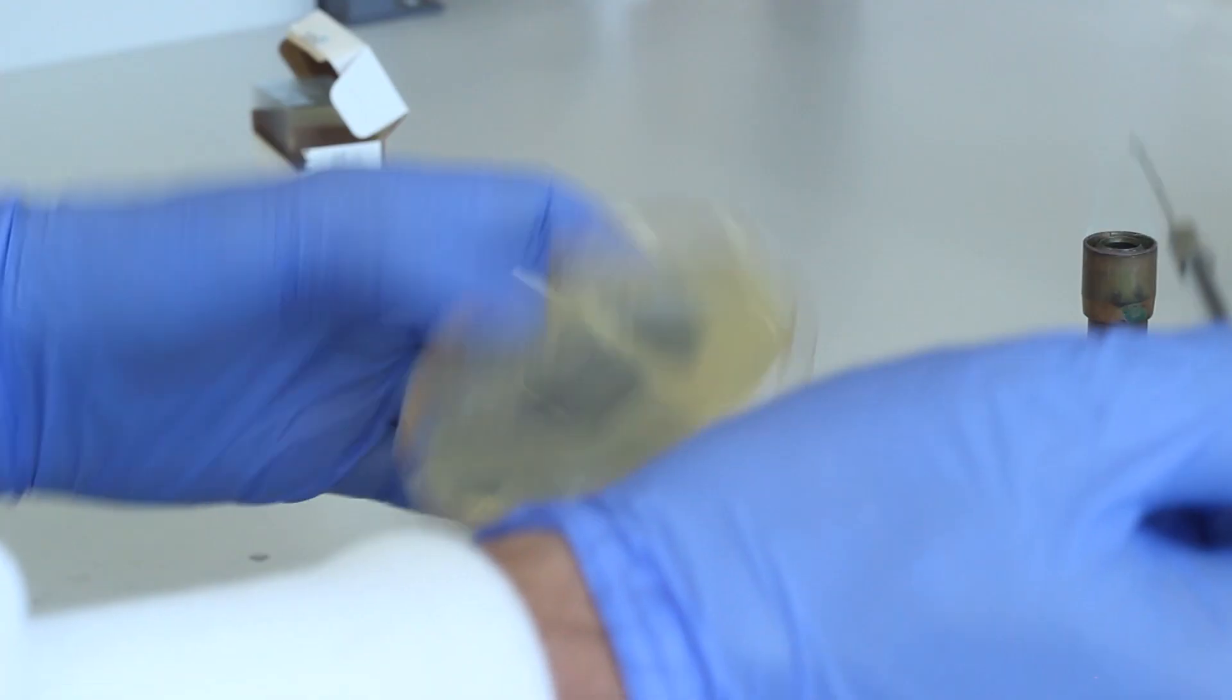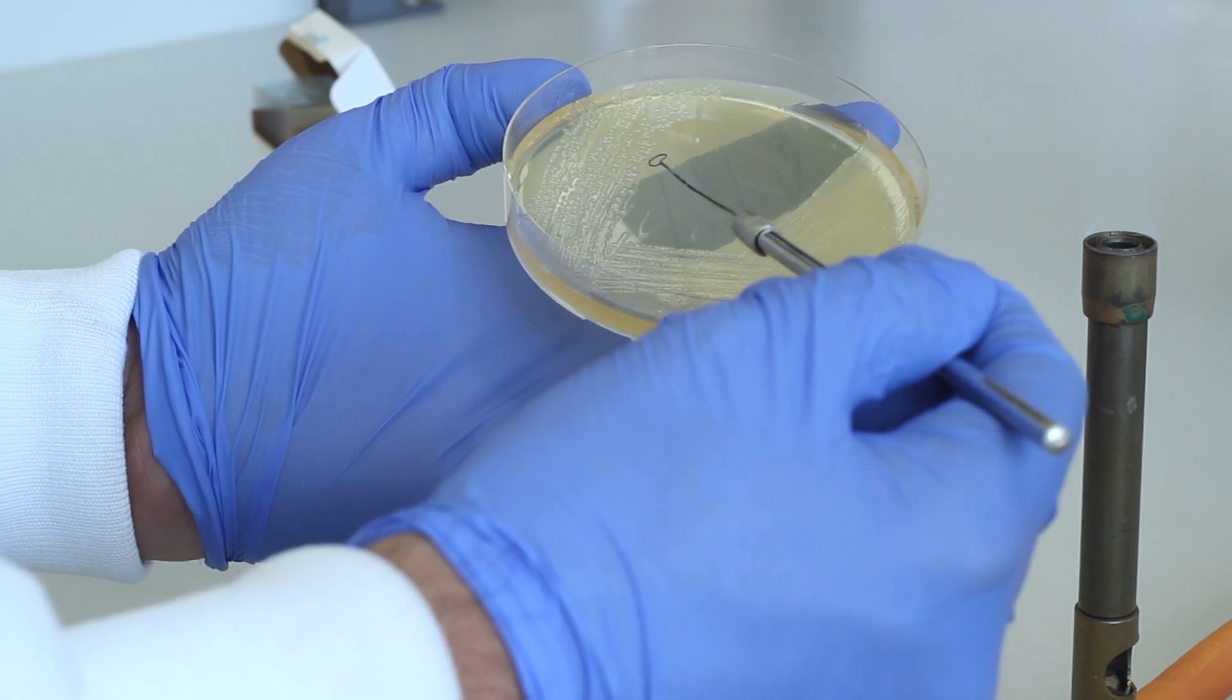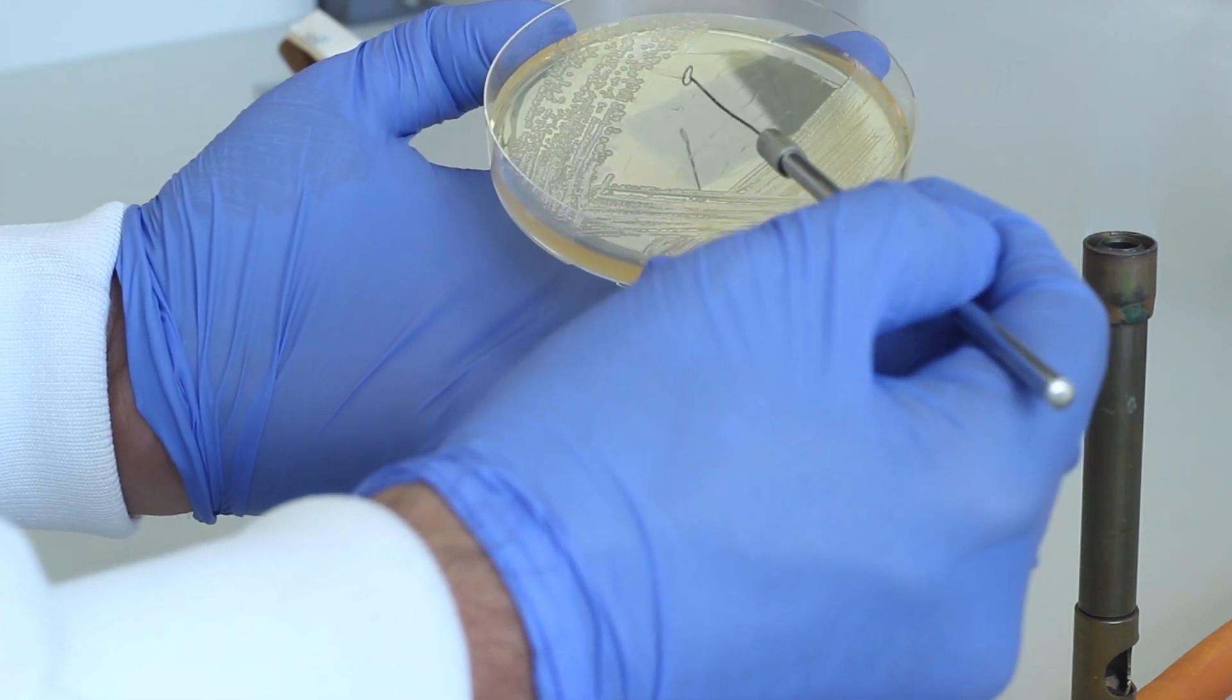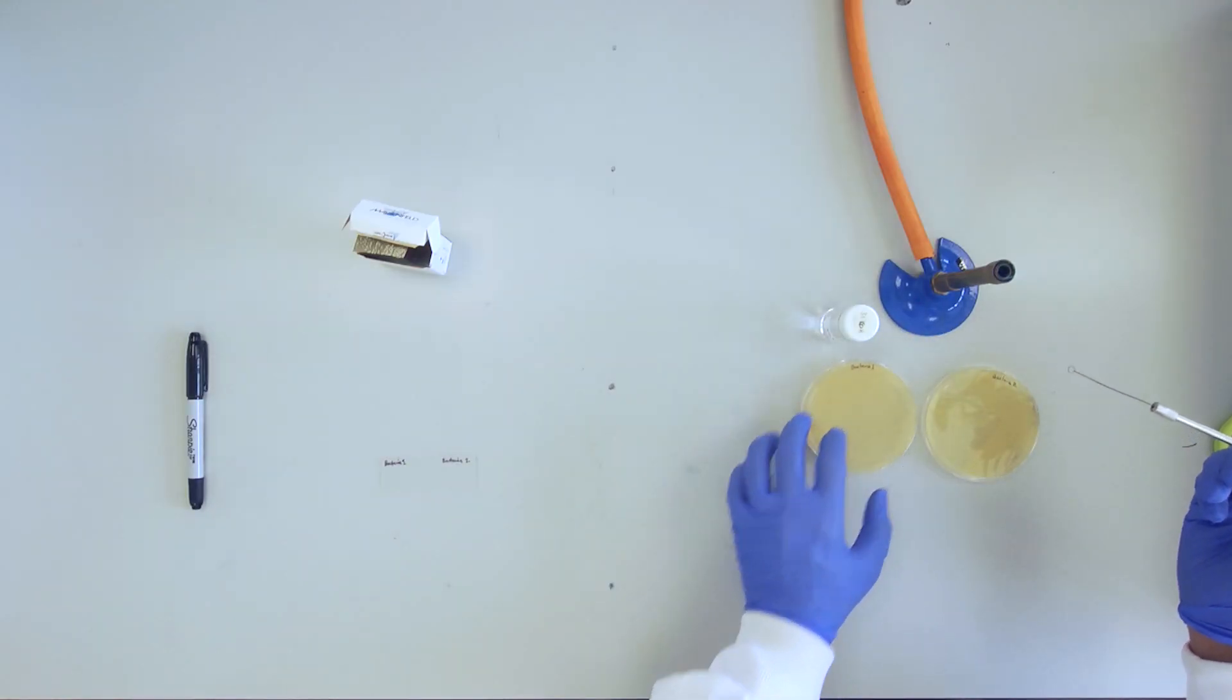Using aseptic technique, take a loopful of the first bacterial colony and emulsify it with the 3% KOH solution on the slide, until well mixed.